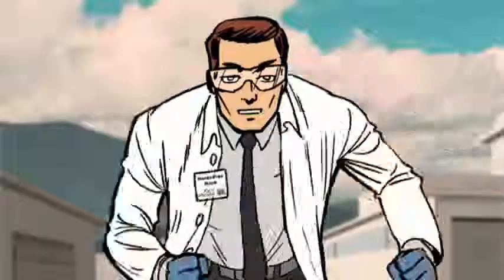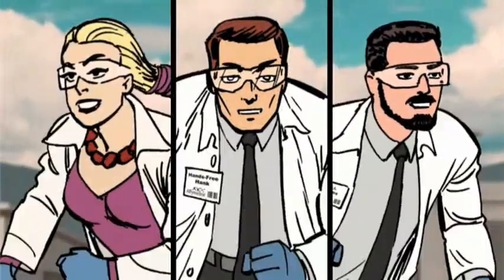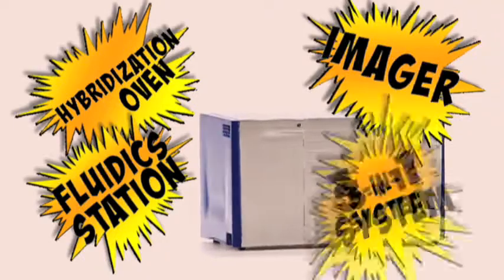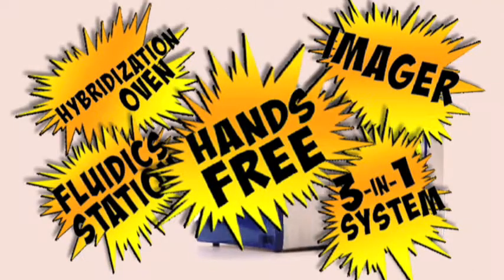The first hands-free microarray processor — Gene Titan! It's the all-new Gene Titan instrument from Affymetrix: high-throughput fluidic station and state-of-the-art imager. It's a three-in-one system with hands-free operation.